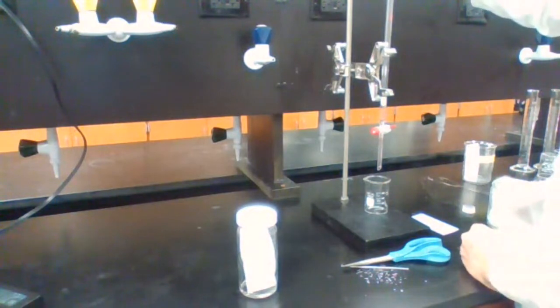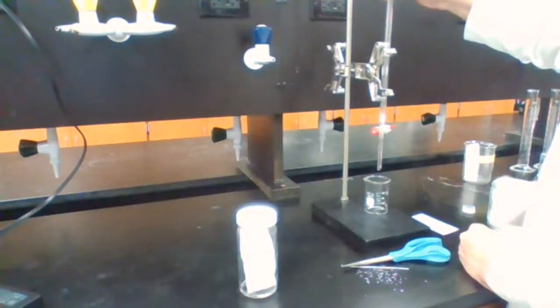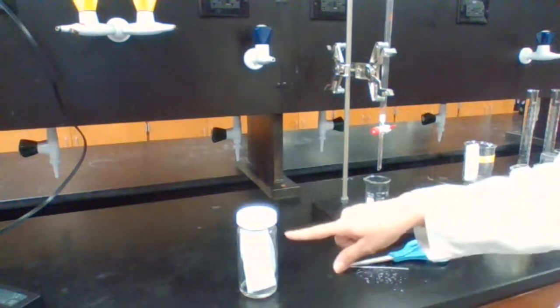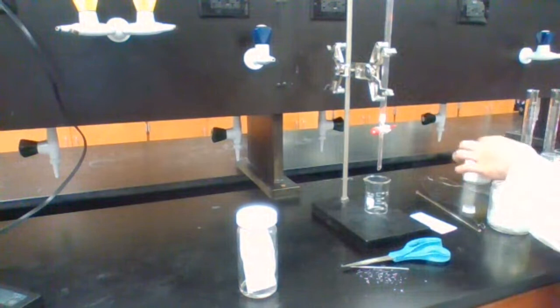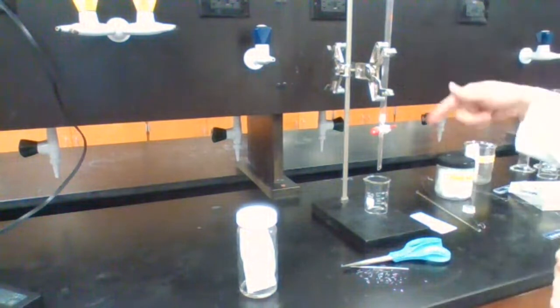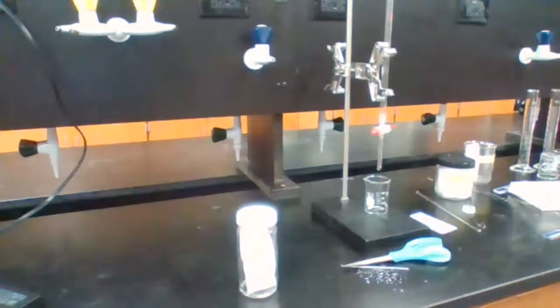With that copper wire, it was actually pulling up every time I was trying to push it down. I had to bring a stirring rod to push it down. While we are monitoring the jar to make sure that it doesn't go past the top, I can work on the preparation of the column for column chromatography.